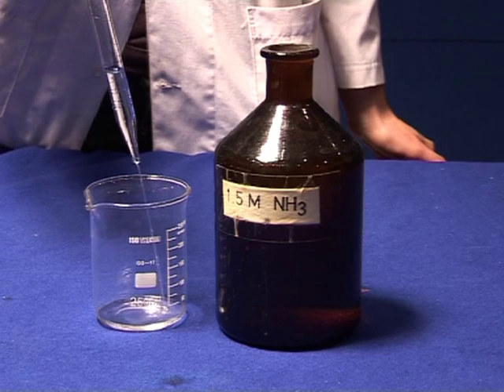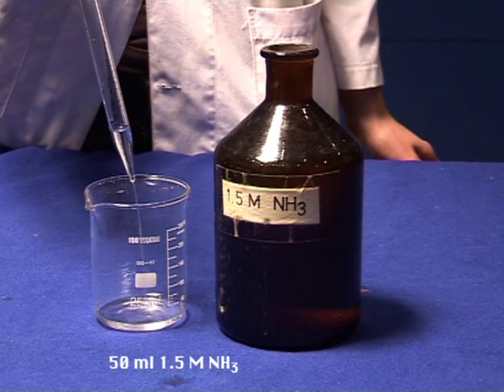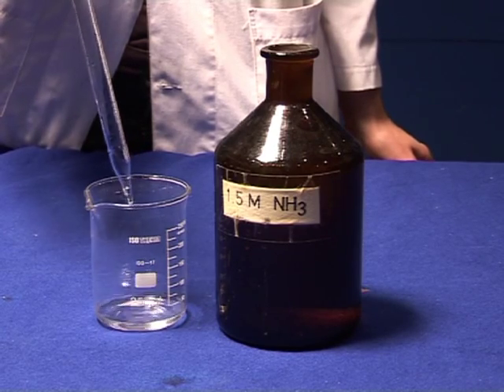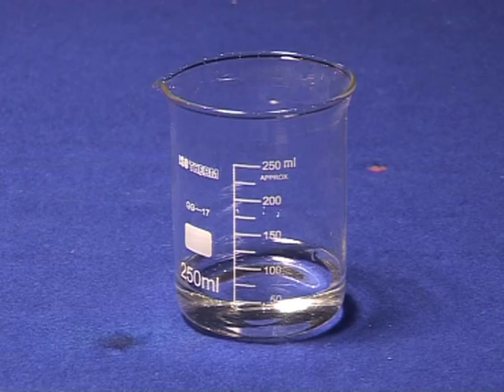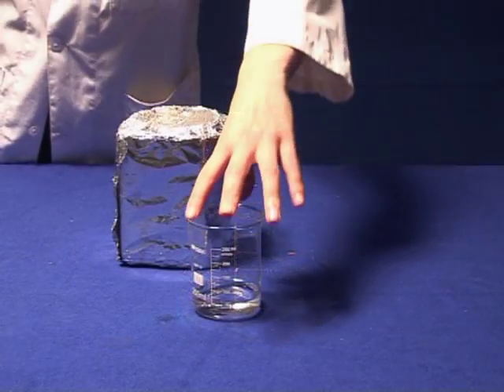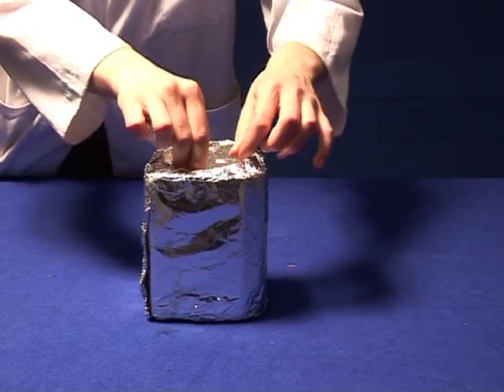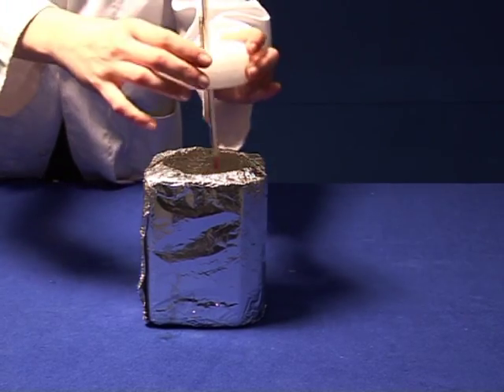Neutralization: Pour 50ml of 1.5 molar ammonia into the beaker. Place this beaker into the insulated cup and collect temperature at 30 second intervals for 5 minutes.